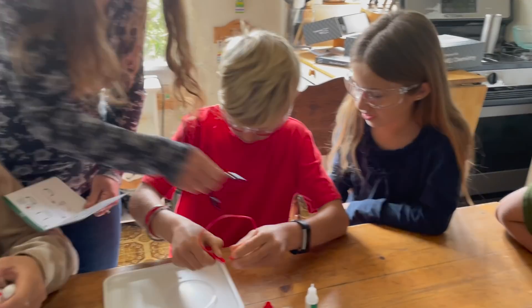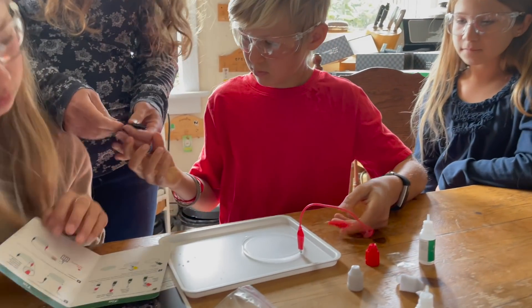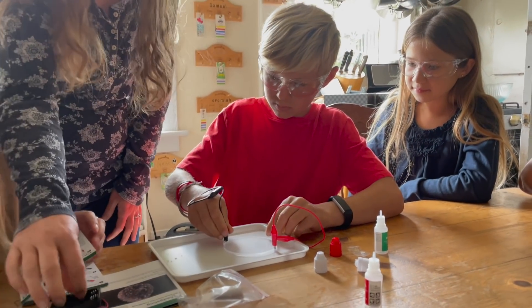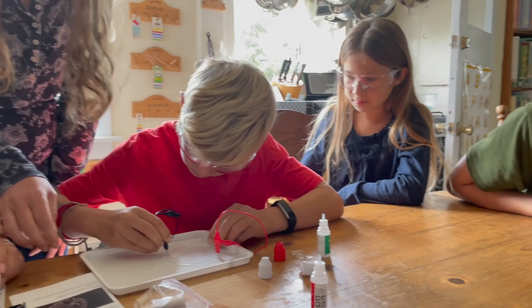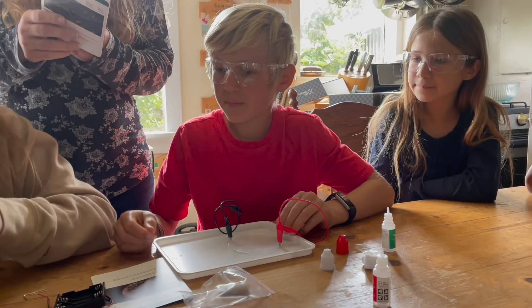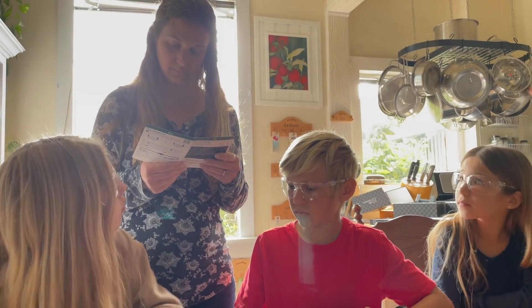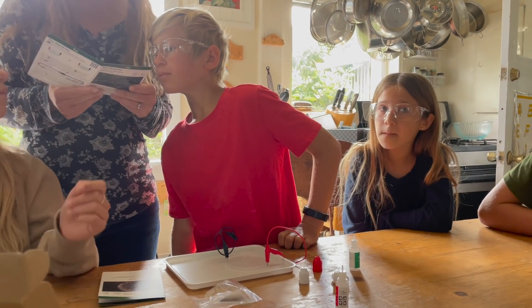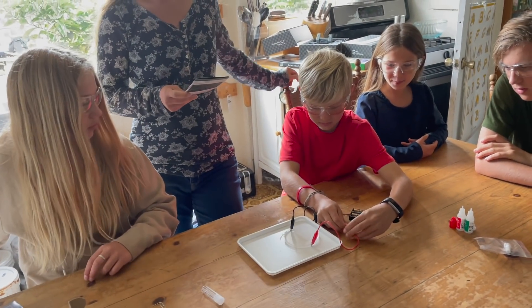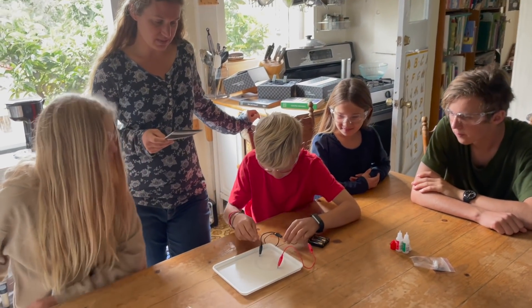Now we gotta get the batteries ready. Are there batteries? I think we might need to get batteries. I can go get batteries. Connect the electrodes to their source of electric current — the batteries. Now the electrons from the batteries cause a chemical reaction, one of the products of which is metallic tin.